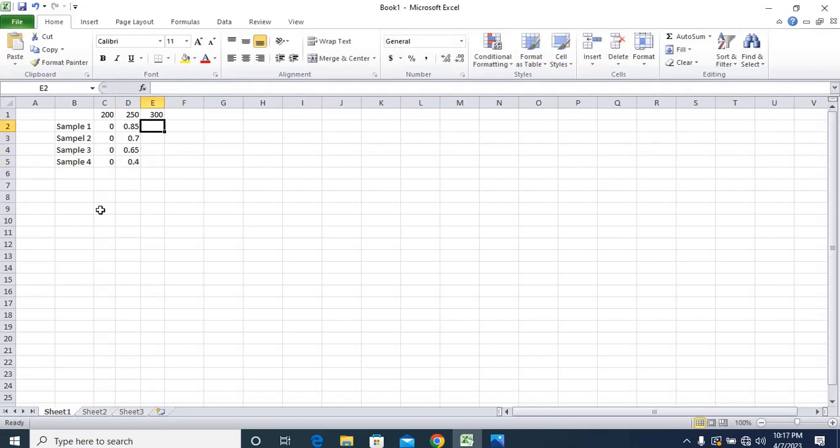Similarly, at 300 nanometer almost different absorption values were there: 0.3, 0.25, 0.25, 0.2, 0.1. Now I will select the data with only 3 parameters. I will include the 3 parameters, not the fourth one. I will include the fourth one later on.